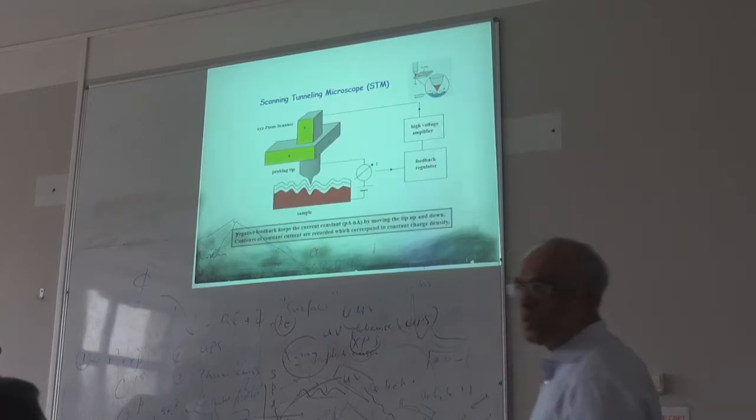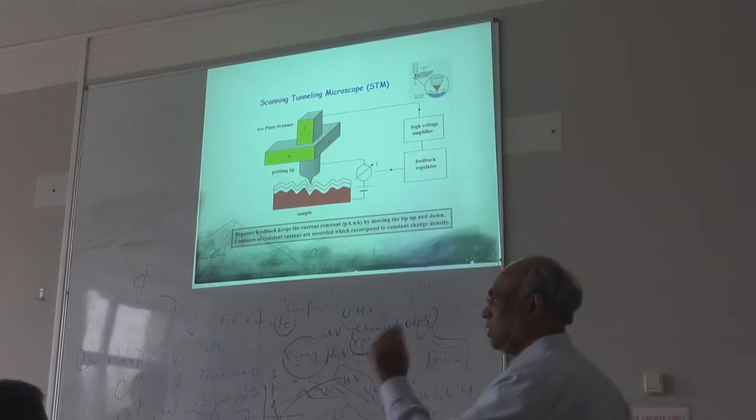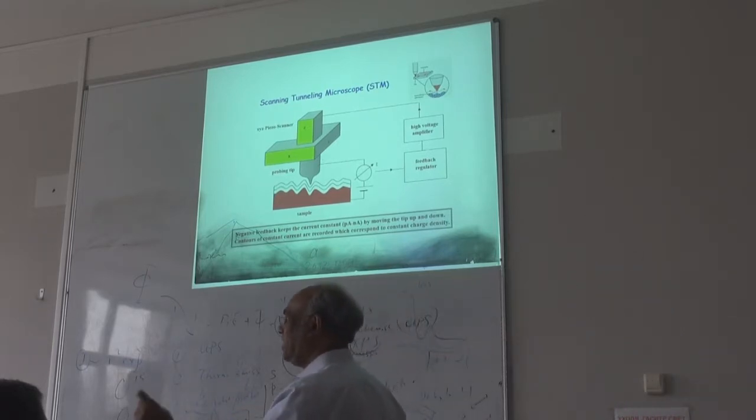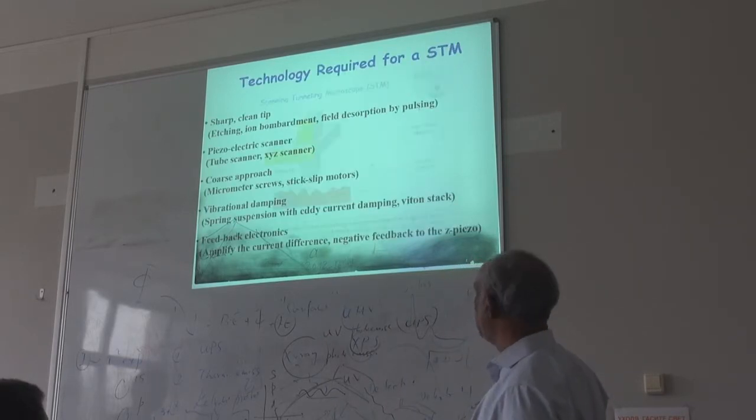Now I think probably everybody is familiar with the STM, the scanning tunneling microscope. This is a nice technique. You can look at atoms directly. It is a very simple technique.